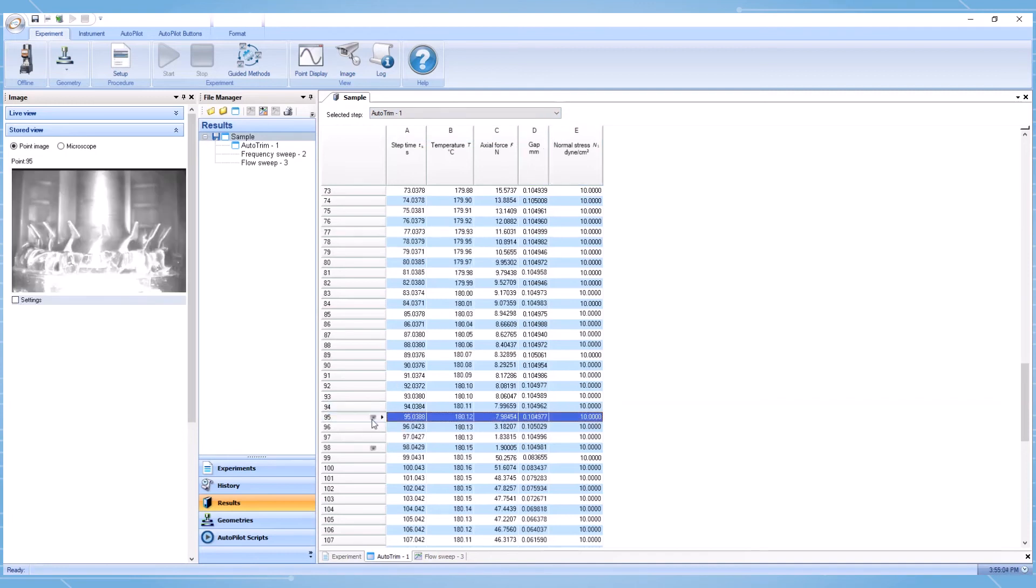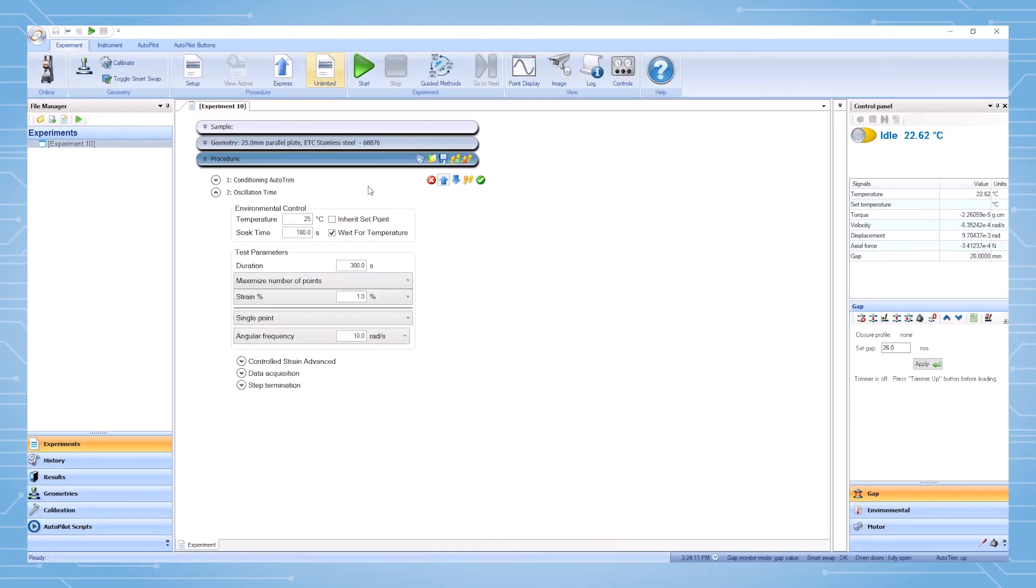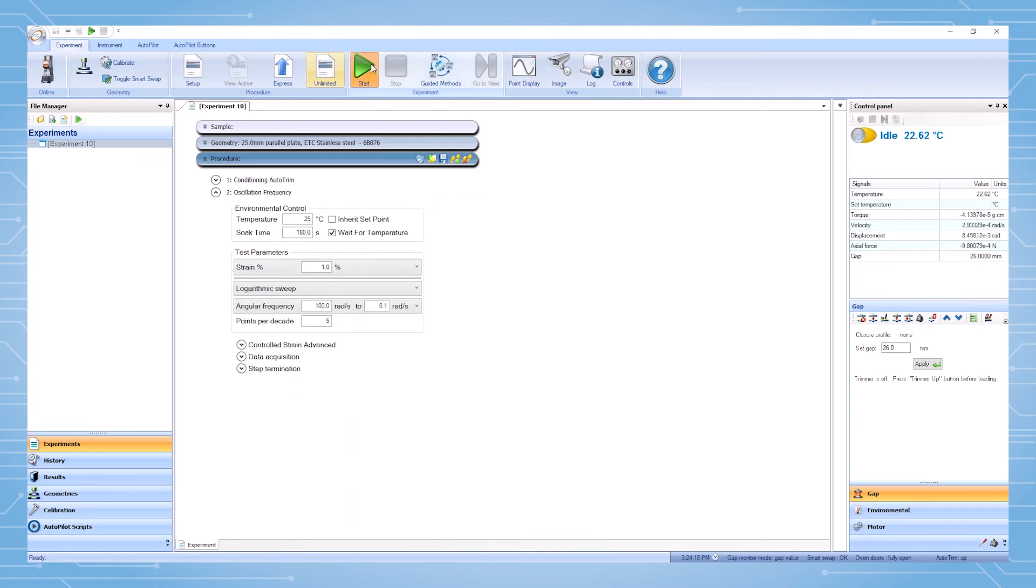The user may then program the testing procedure following the trimming step, press start, and walk away.